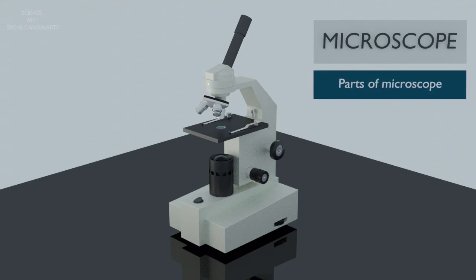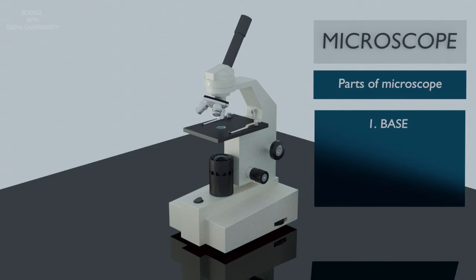Parts of microscope. Base. The base provides support to the microscope. Arm. The arm supports the tube and connects to the base of the microscope.